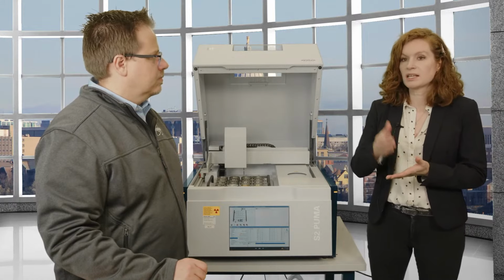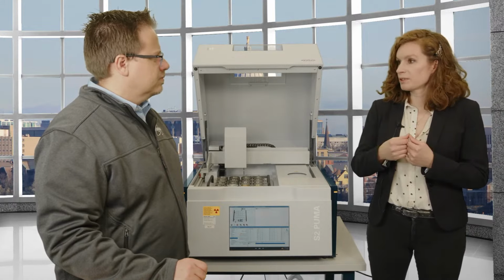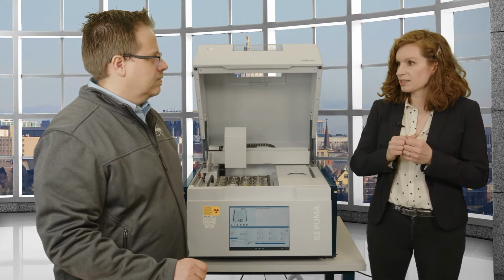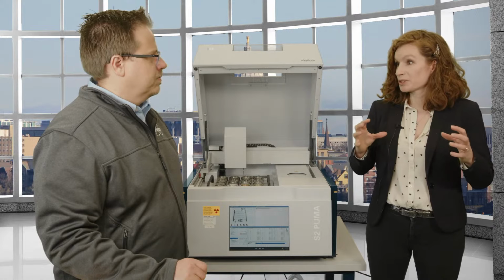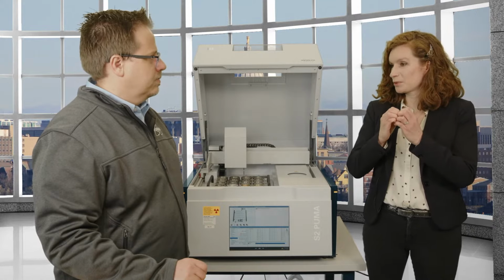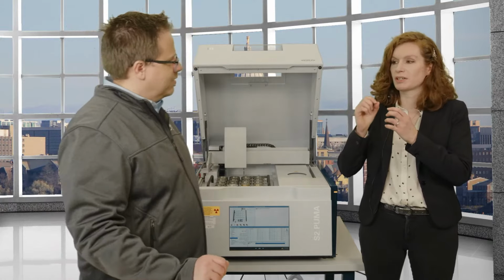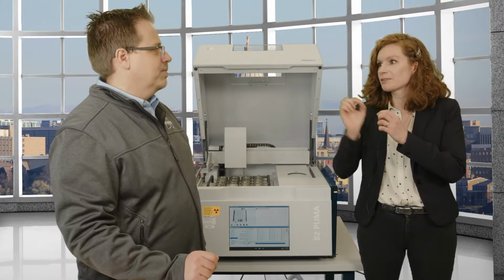So accuracy means, if you think about it as a bullseye, how close to the center of it is it? Right? Whereas the precision is how close several measurements are to that hit in the bullseye. Even if it's on the side, it might still be that you measure 10 times and it's always right off the same part.